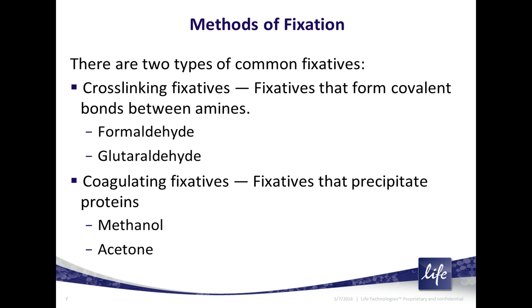More commonly, people will make their own paraformaldehyde solution from powder, but it's a process that takes a little bit of time, and there's heat, and it's somewhat toxic. Here at Molecular Probes, we tend to buy the electron microscopy grade 16% formaldehyde from various distributors. That solution is kept in small ampules and does not have methanol in it.